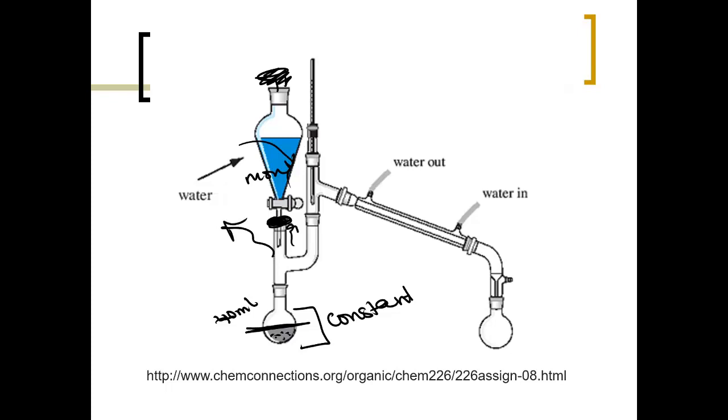And then on the other side, as the steam from this comes out, it's going to go up. So you're going to register the temperature here once the steam comes up, and then as it starts cooling in your condenser, it will precipitate down. So here will be your water plus your clove oil.